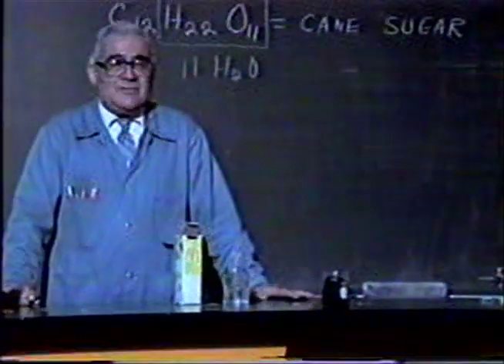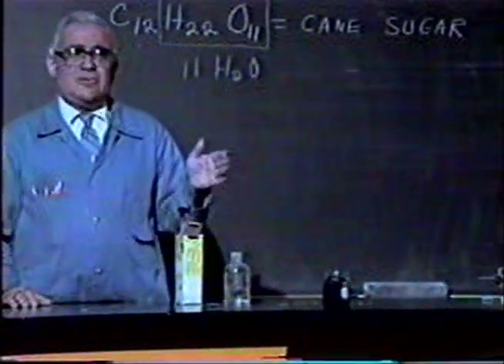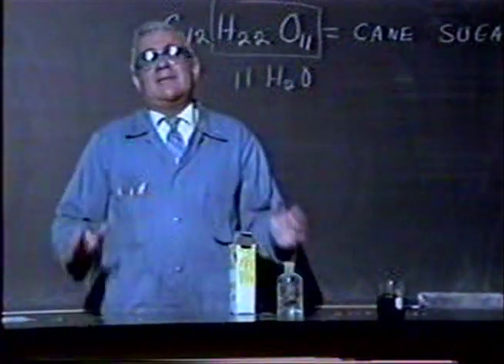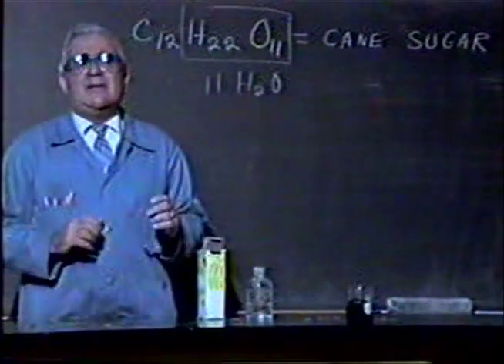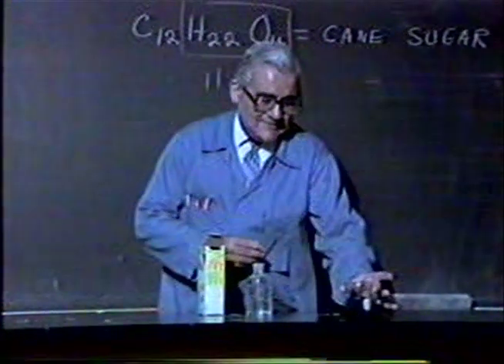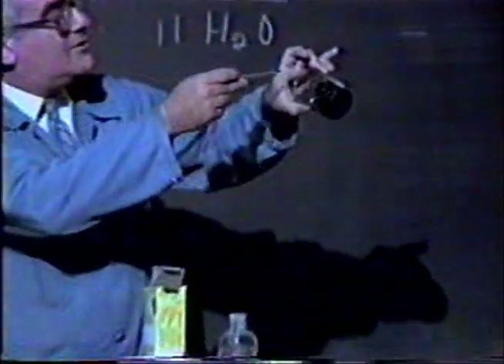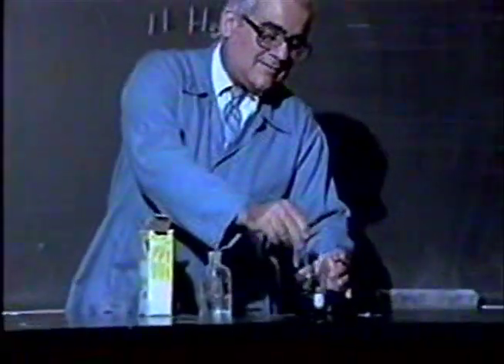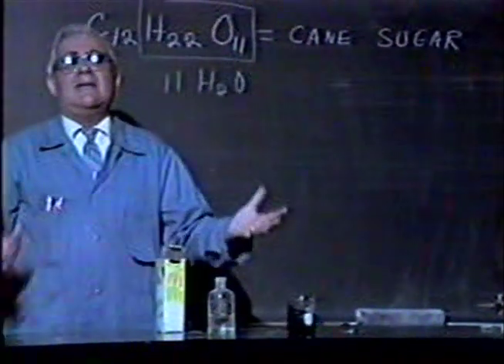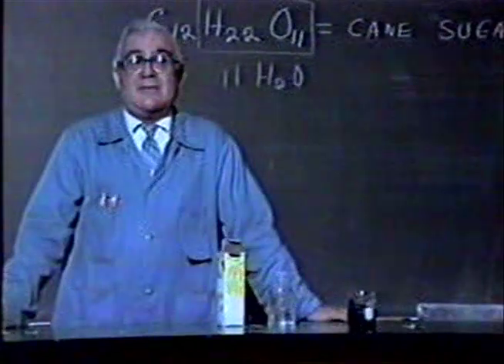This is a very good demonstration for two reasons: to show that you can break a compound down into the elements that make it up, and to show what a strong affinity sulfuric acid has for water. If you look at this compound — I can grab the top of the beaker where it's not so hot — you can see that it's a solid. It's the same material that you find when you burn your toast: pure carbon. A little bit of sulfuric acid is clinging to it, so I wouldn't recommend eating it. But this is carbon, and it's so warm that I cannot put my hand on the beaker without burning it. And that concludes this demonstration.